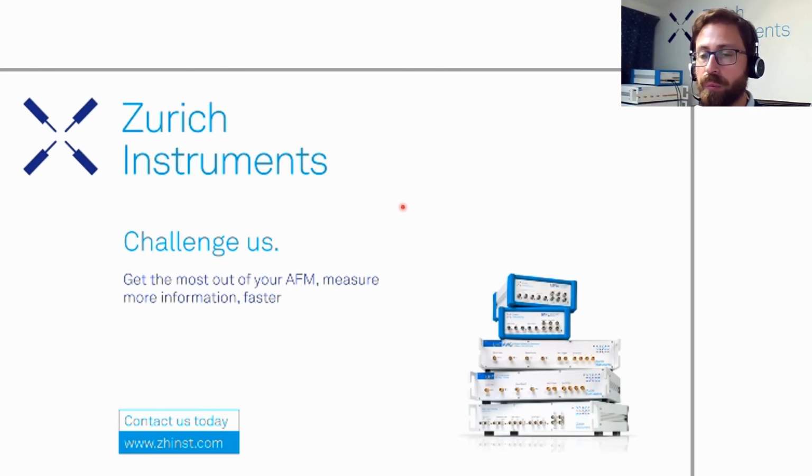You can also be far away. Actually, for tip lift, people can go up to 100 nanometers. But of course, the closer you are to the surface, as we also saw on the graph, the higher the contribution you get. So there is no limit. Of course, you don't necessarily want to be in the repulsive regime, but the closer the better for the CPD resolution.